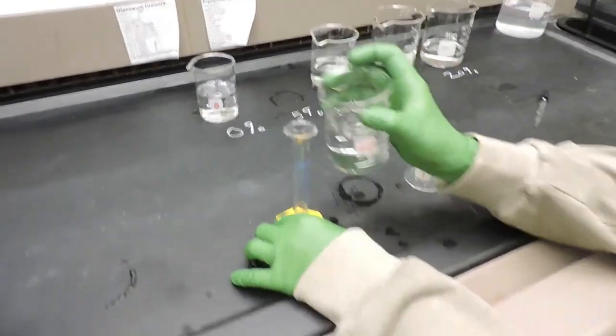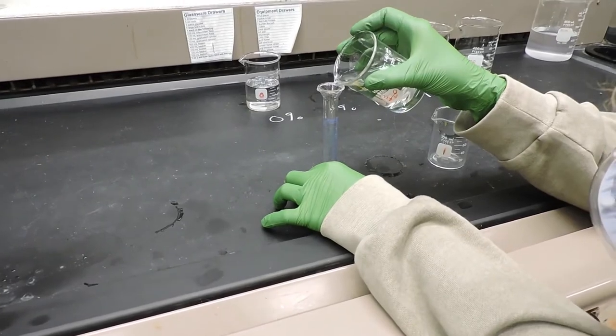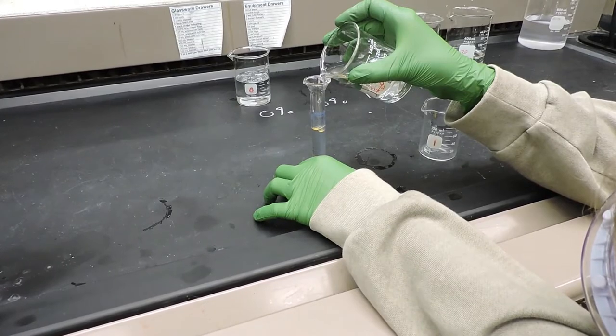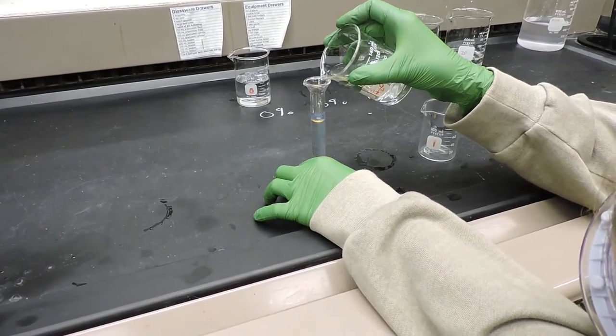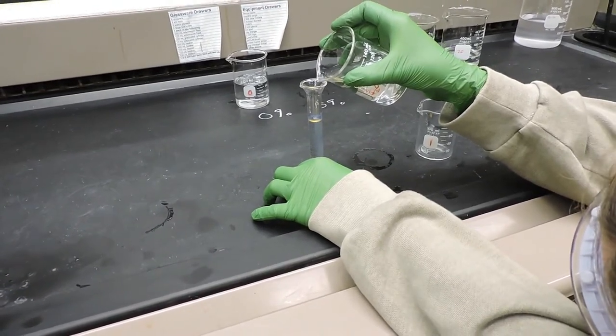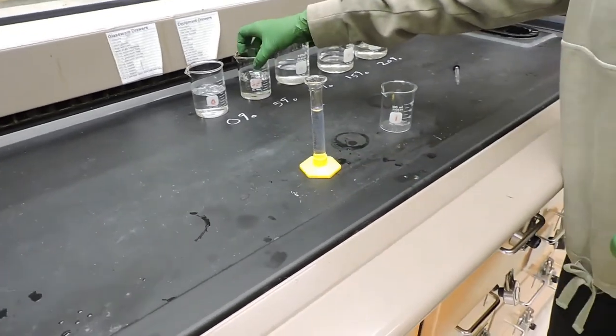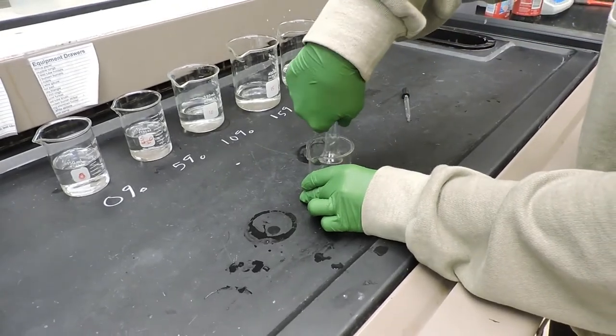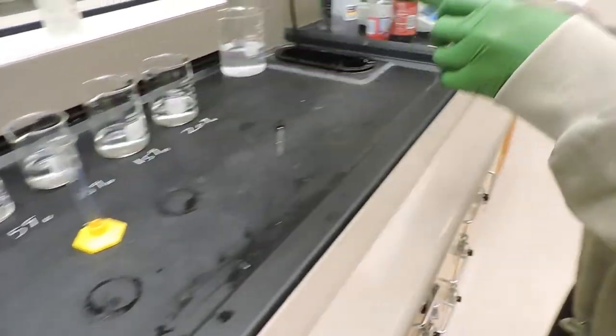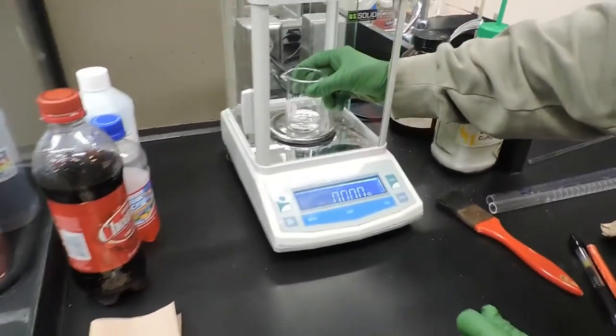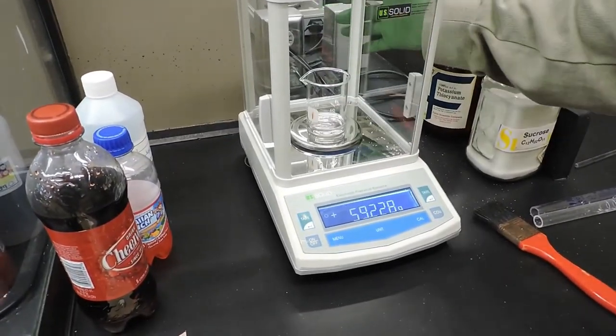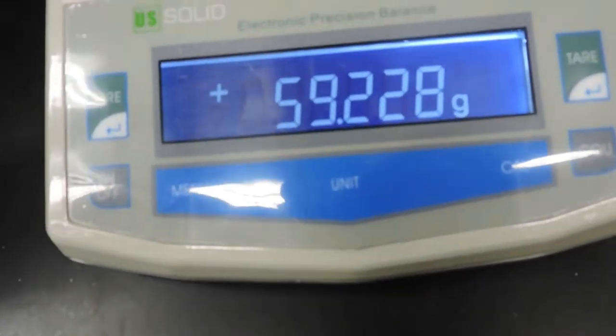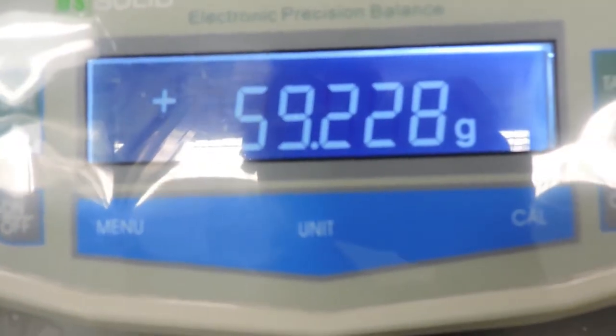This one will be the 5% sugar solution. And then we'll weigh it again. The mass of this 5% solution, 10 milliliters, will be 59.228 grams.